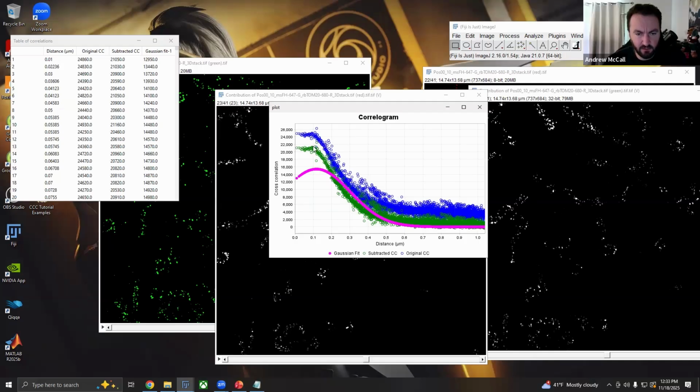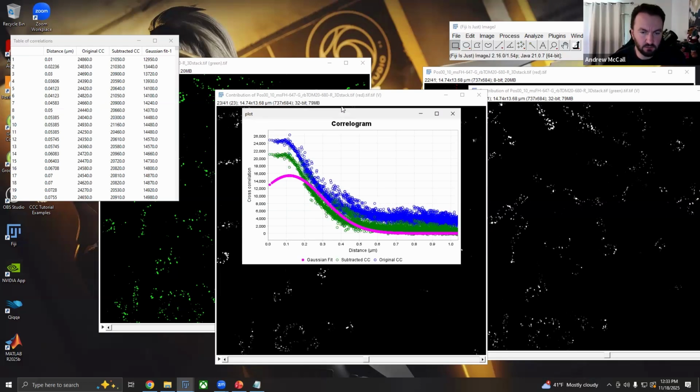I'm not really sure what generated that, but that would mess up the algorithm, because in order to fit data near 0 like this, CCC actually mirrors this data from the peak. So it finds the peak of the data and then mirrors it across the other side, because the fitting algorithm that I have does not do well with bounded data. So I had found out that mirroring the data works pretty well. But when you have random peaks like that, it can cause issues.